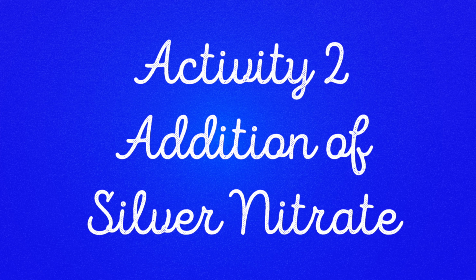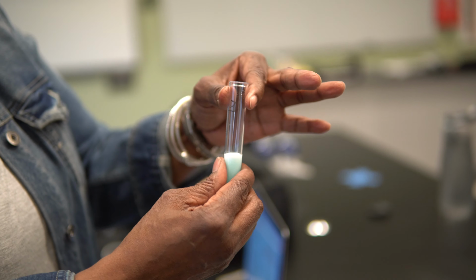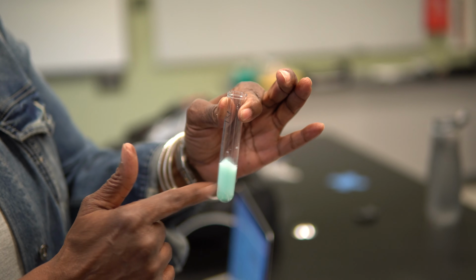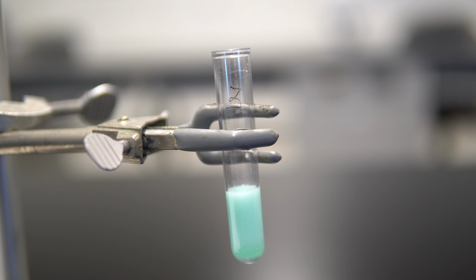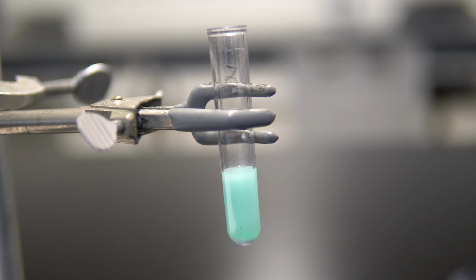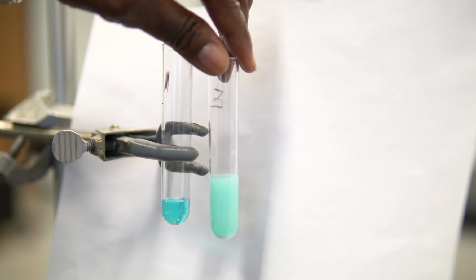Activity 2, addition of silver nitrate. Add 1 milliliter of silver nitrate solution to test tube number 3 and gently swirl to mix the solution. Allow the solution to sit for 5 minutes. Record all observations in data table 1. Take a photo of test tube number 3 and test tube 1.